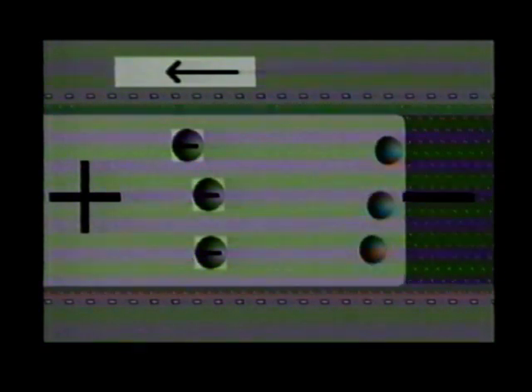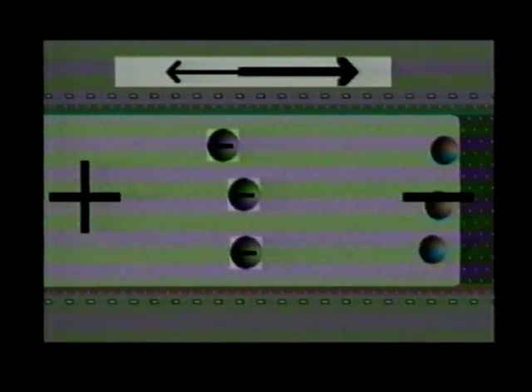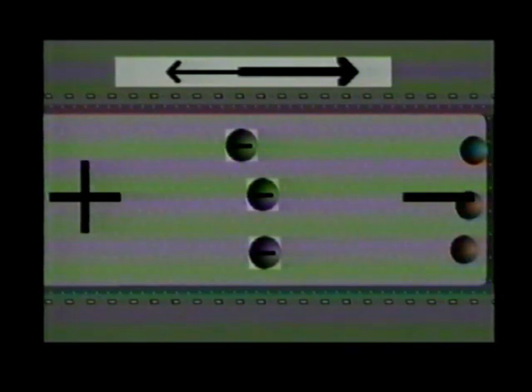The bulk flow of solvent due to electroosmosis can result in the elution of both neutral and negatively charged species at the cathode. Cations will migrate ahead of the flow front, and so will elute first. Neutral species will be carried along by the electroosmotic flow and will elute next. Although anions attempt to migrate towards the anode against the electroosmotic flow, in most cases the electroosmotic flow is sufficient to cause a net movement towards the cathode, and so the negatively charged species will eventually be detected.